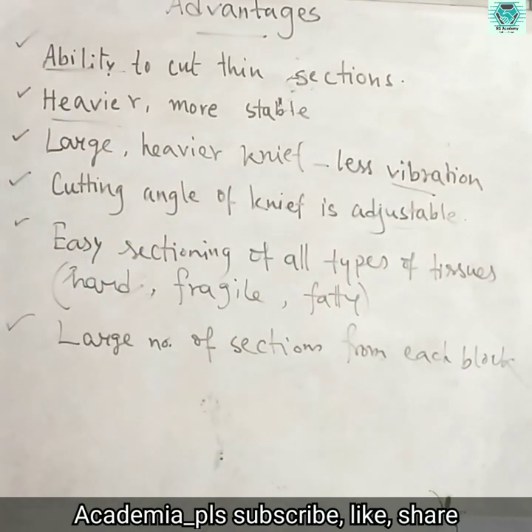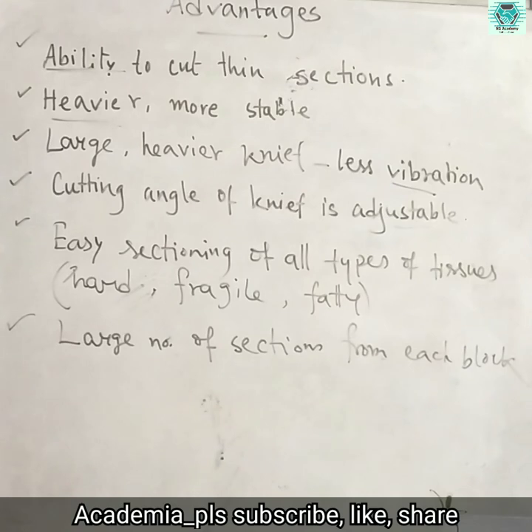It allows easy sectioning of all types of tissues, whether hard, fragile or fatty. Hard tissues means tissues whose composition is a bit compact. Fragile means tissues which can easily break down, and fatty tissues have lots of fats inside. So all types of tissues can be cut by the rotary microtome, and we get a large number of sections from each tissue block.